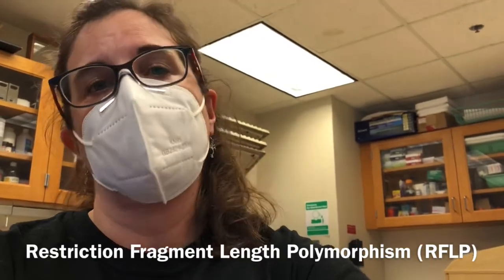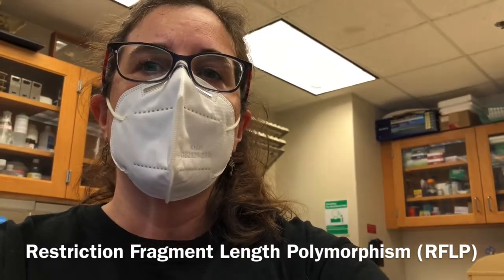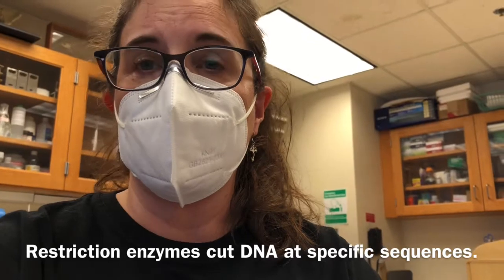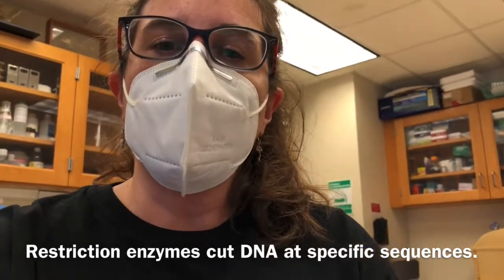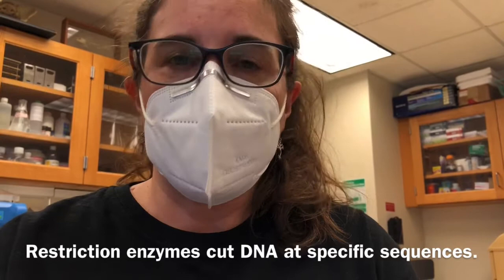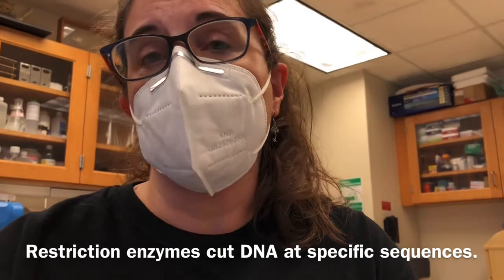Hello everyone. I am in the genetics lab and I'm going to be performing the next experiment for you. This experiment is restriction fragment length polymorphism, which is a fairly common technique used in genetic labs to create very specific cuts in DNA. We use these things called restriction enzymes — special types of DNA nucleases that find a specific sequence in the DNA and cut it. Now I'm going to show you the technique we would be doing if we were actually working in the lab.